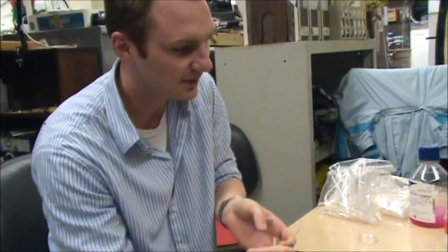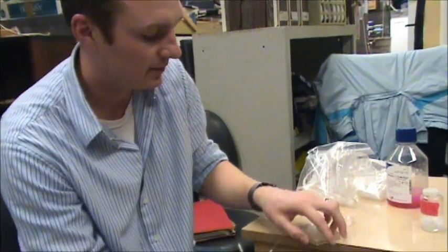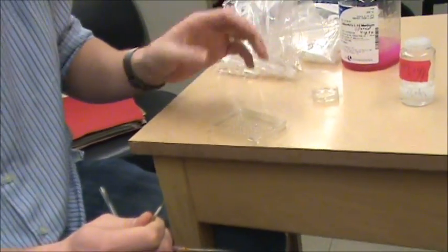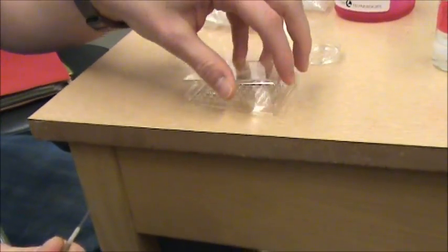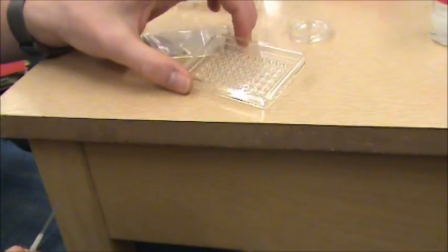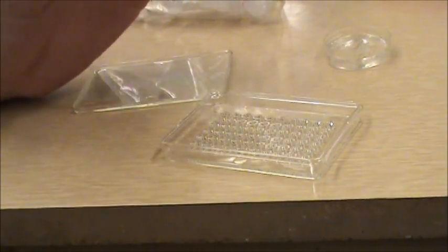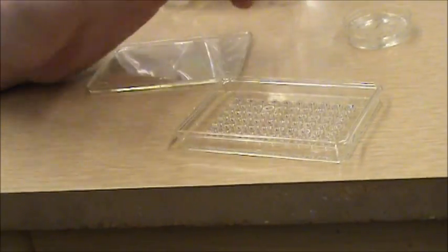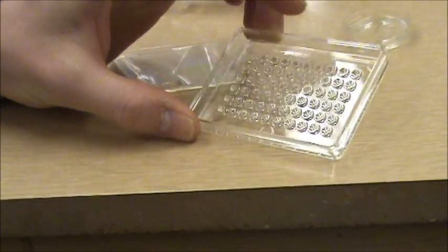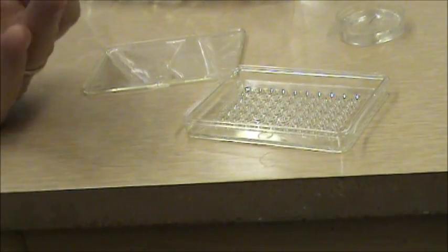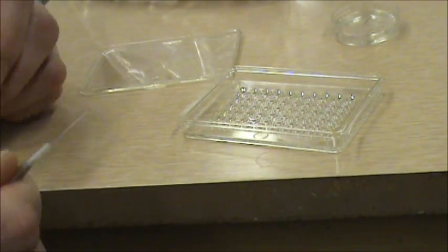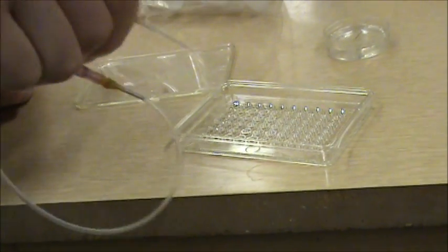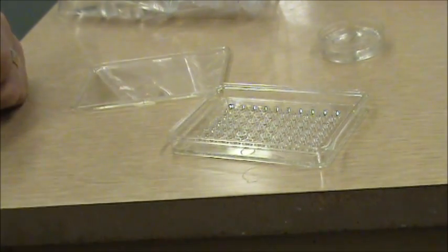Then once we suck them out of the ganglion we will have our L15 mixture on these culturing tray dishes, either with gentamicin or antibacterial or without depending on how long we want to culture them. We just place them into these nice dishes and these fit on our microscope. Then we can come in with our microelectrodes and make recordings and stimulations.